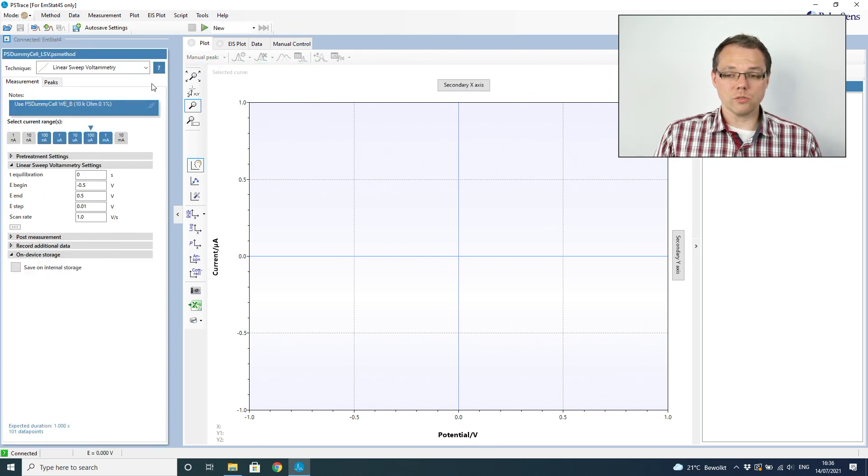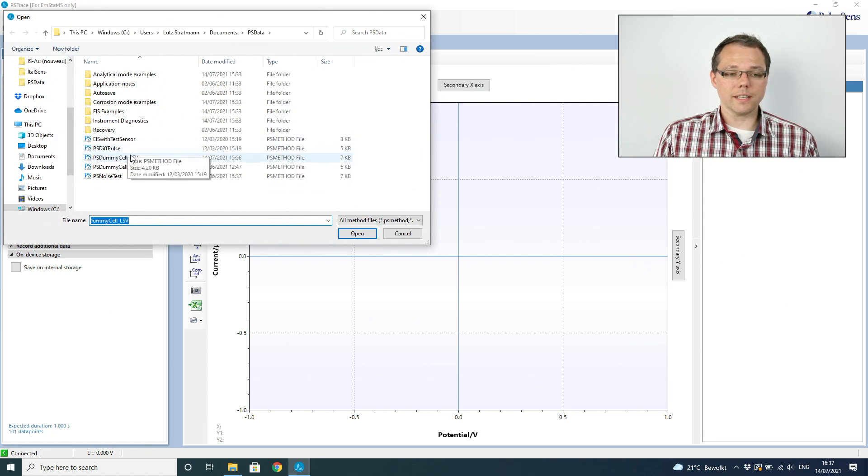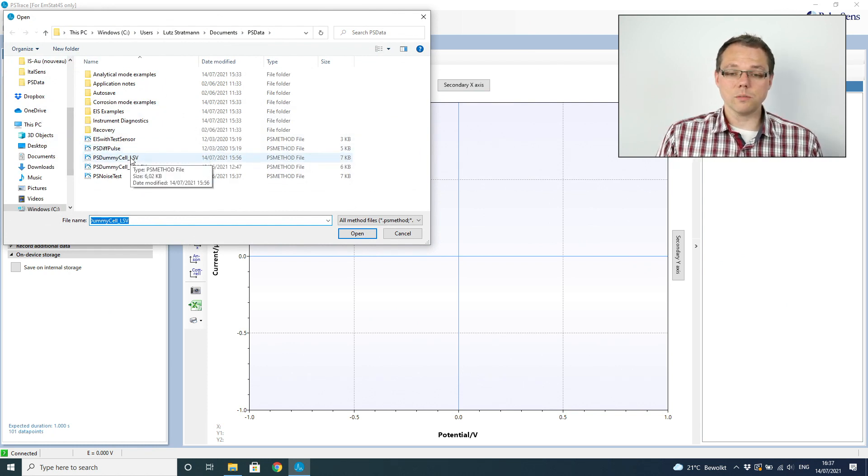Now we're ready to do a measurement, but we should first check that we have the right parameters set. For this test measurement, we're going to load a method file — a file that contains just the parameters for a measurement, no curve or data. Method files are very handy if you often do the same measurement, or to prepare a measurement for someone else to perform. In this case, it's our first measurement. I load this method file, and when I open it, you see the parameters are set for me.